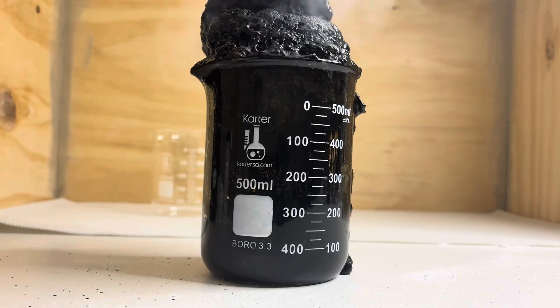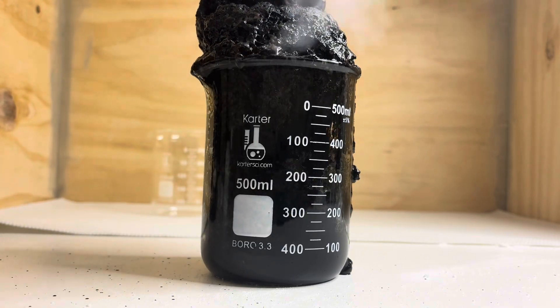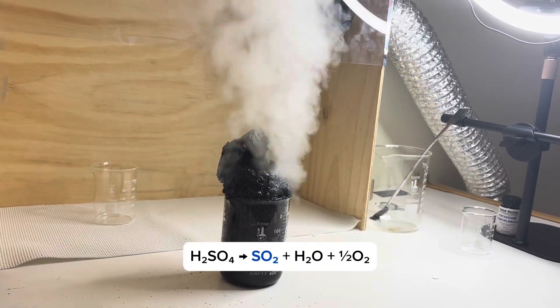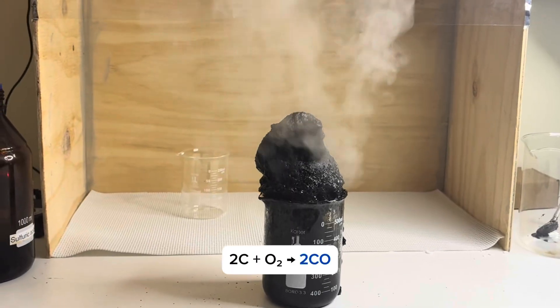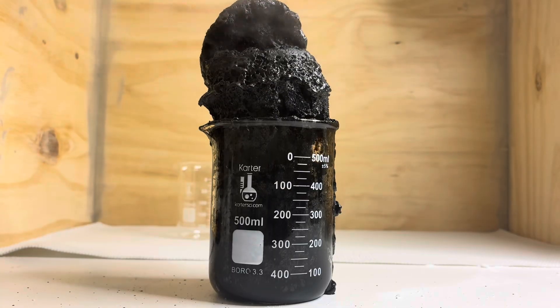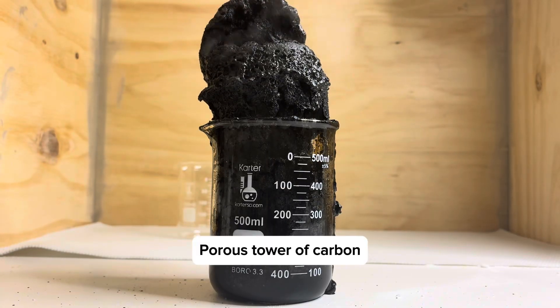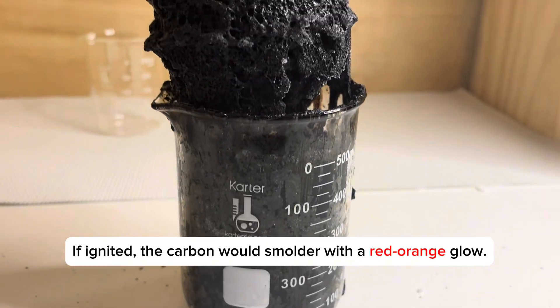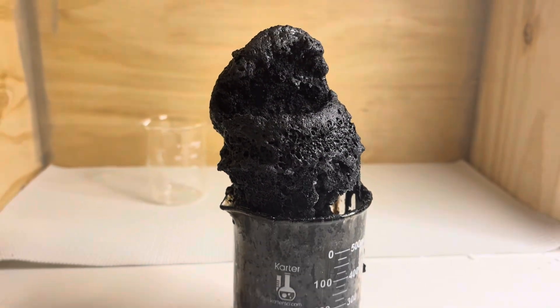The steam is mostly hot water vapor, but it can also contain sulfur dioxide and carbon monoxide. The carbon keeps rising and expanding into a porous tower. If ignited, it would smolder like coal, glowing red-orange as it burns.